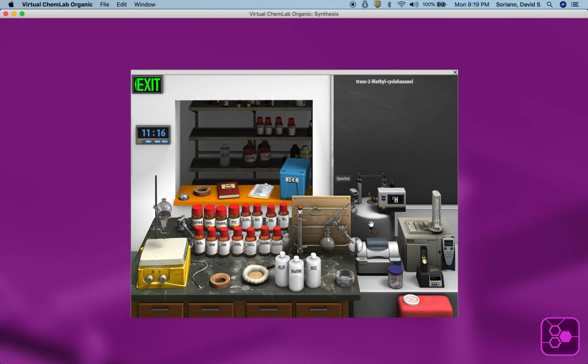Let's look at the hydrogen NMR, proton NMR. Got to line it up just right. You've got to be patient. Maybe they don't have the NMR for that. You'd have to look it up. Let's try C13. Nope, they don't have it. So you'd have to look those up.